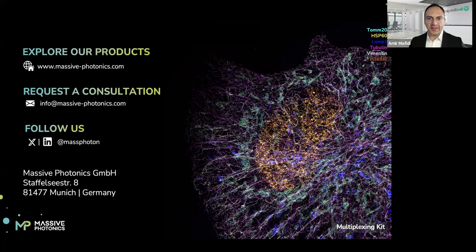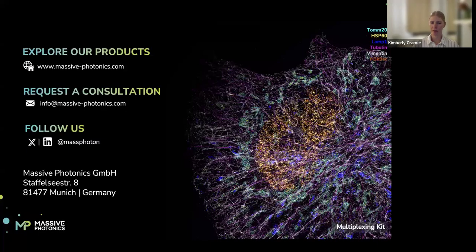Jinron asked, is DNA paint toxic for the cell, and is it possible to use it for live cell imaging? So DNA paint, we typically use, or you kind of need to use it on fixed cells because it is similar to STORM, you're imaging on the time scale of minutes, and you need to do immunofluorescence. So it's not really compatible with live cell imaging.